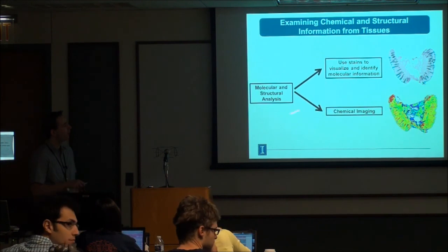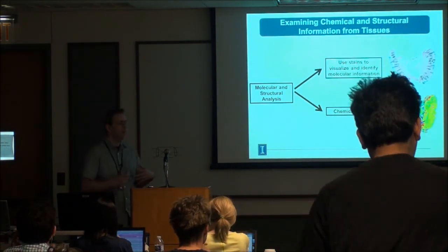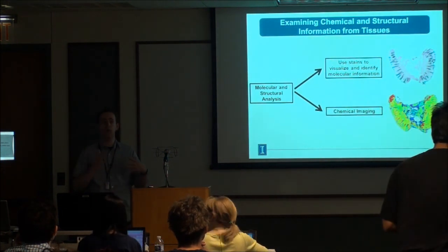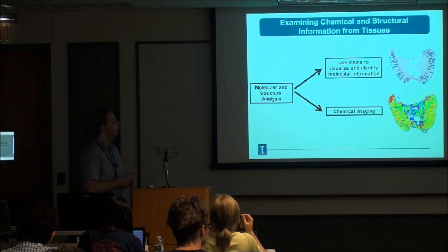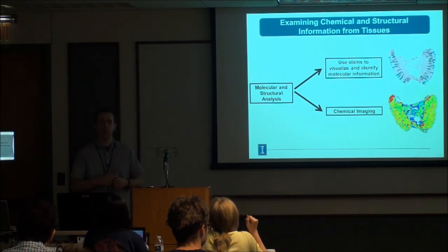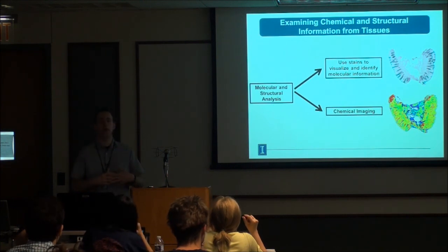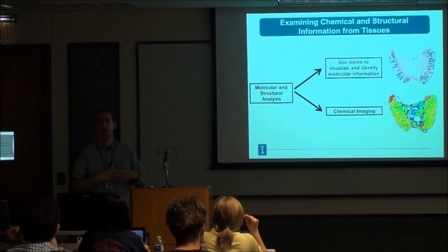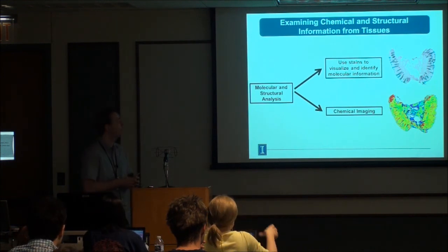Okay, so what we're developing is an alternative to this, which is called chemical imaging. This in general includes FTIR and also things like Raman spectroscopy and near-infrared. Matt Shumerick spoke to you all last Thursday about Raman spectroscopy. So FTIR is a complementary technology. It's much faster than Raman and is much more amenable to imaging.